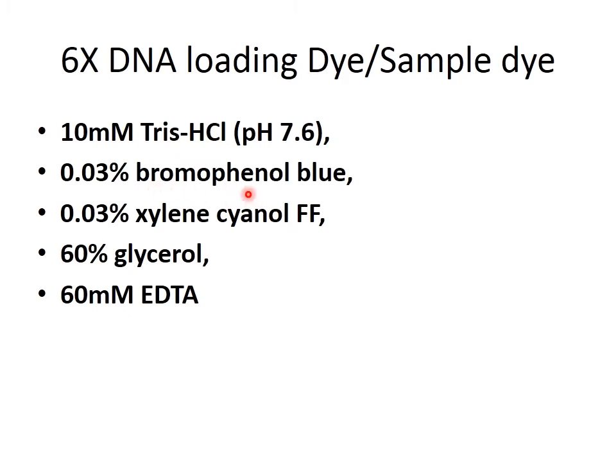So the dye is also negatively charged, and it migrates towards the positive terminal. When DNA is migrating, it will not be visible in the gel, but bromophenol blue, which is a blue color dye, would be visible. So we can use this as a tracking dye to notice the migration of DNA within the gel.